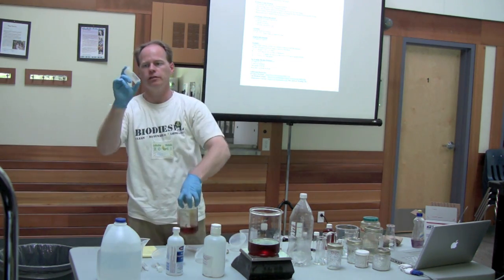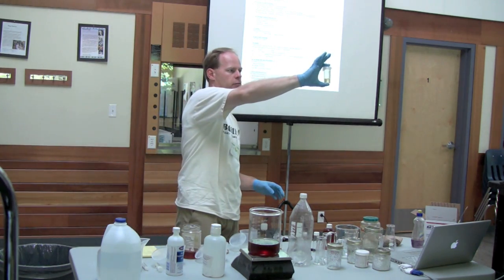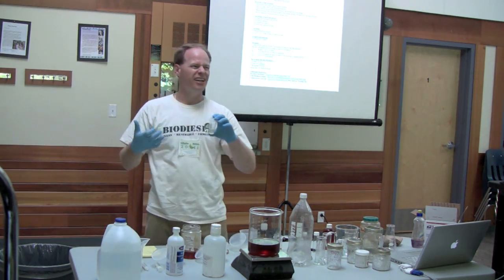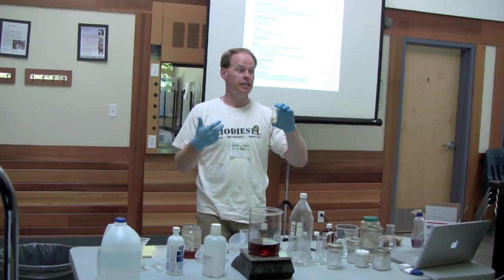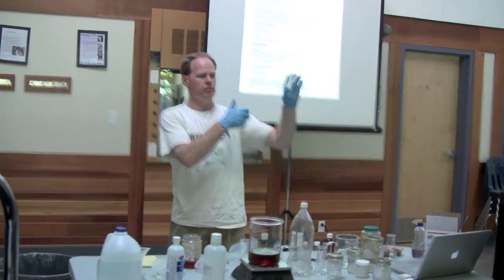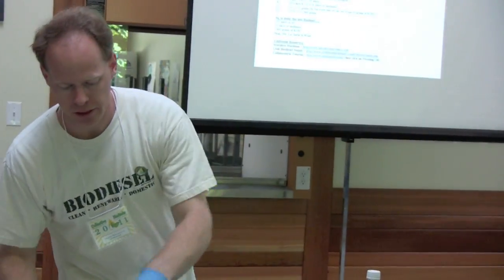You want the oil to fully dissolve into the isopropyl alcohol. One trick I use is I have a really high heat gun, and I'll heat my little container for a second and get it nice and warm before I try to do it. Because in the winter in Utah in my shed, it isn't quite as cold as up here, I'm sure.